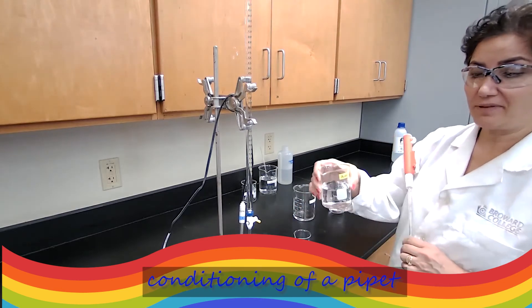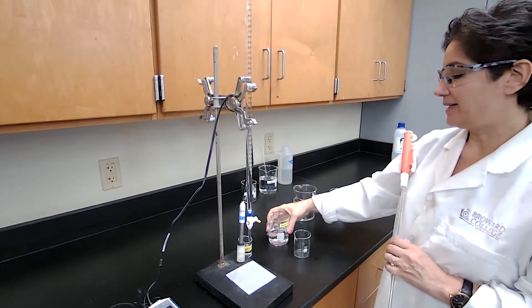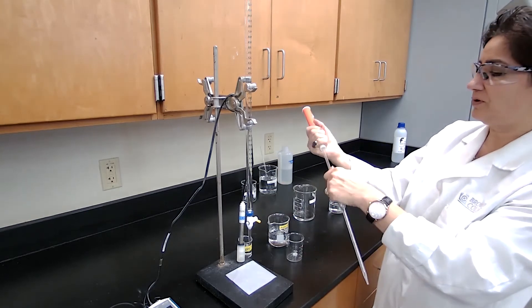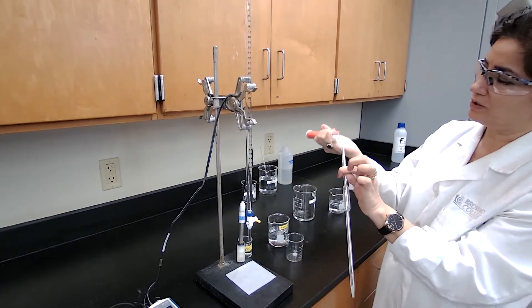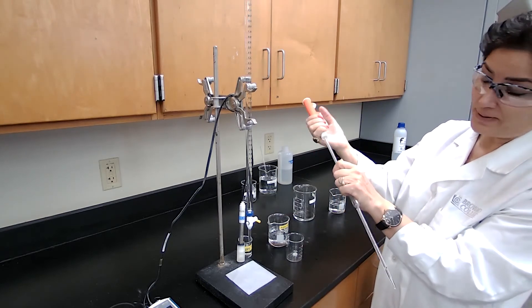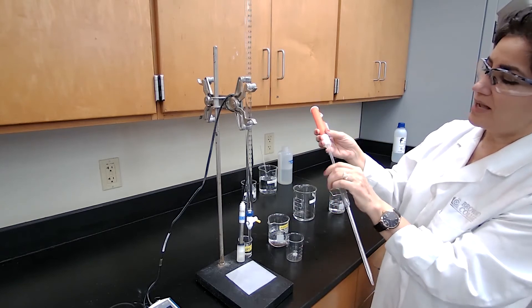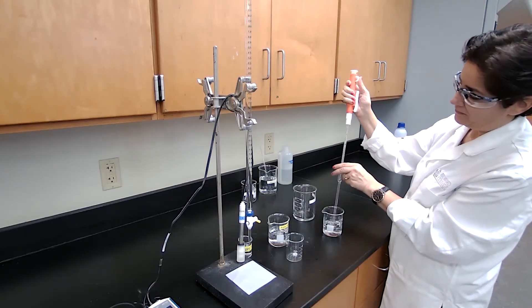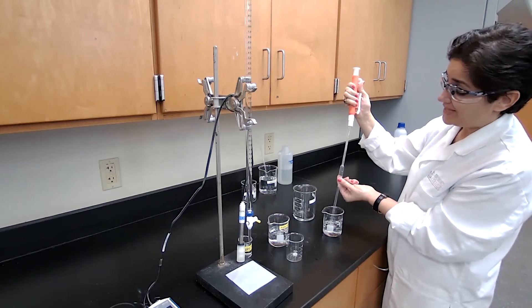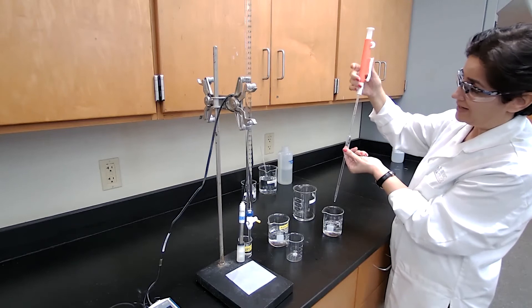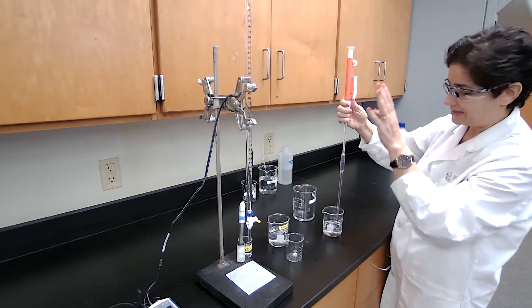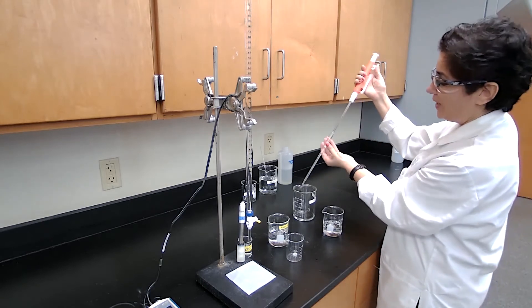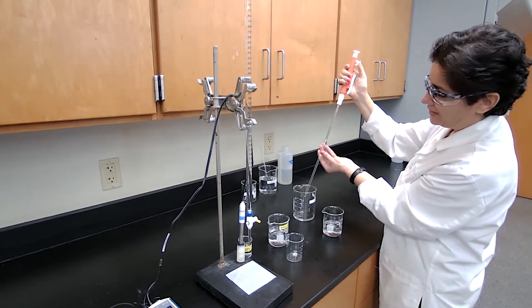For titration of the weak acid, we have the acetic acid which we are going to titrate. I need 40 milliliters of that acid. Before using the burette, I already showed you how to use it. What we are going to do is insert the end of the pipette into pipette pump and wash it with distilled water. The benefit is, first, we can never assume that glasswares are clean. Second, if the pump is not working—if I stop it and it will stop dripping—then I have to change the pump. And at the same time, I need to wash the pipette to make sure that I'm starting with a clean pipette.